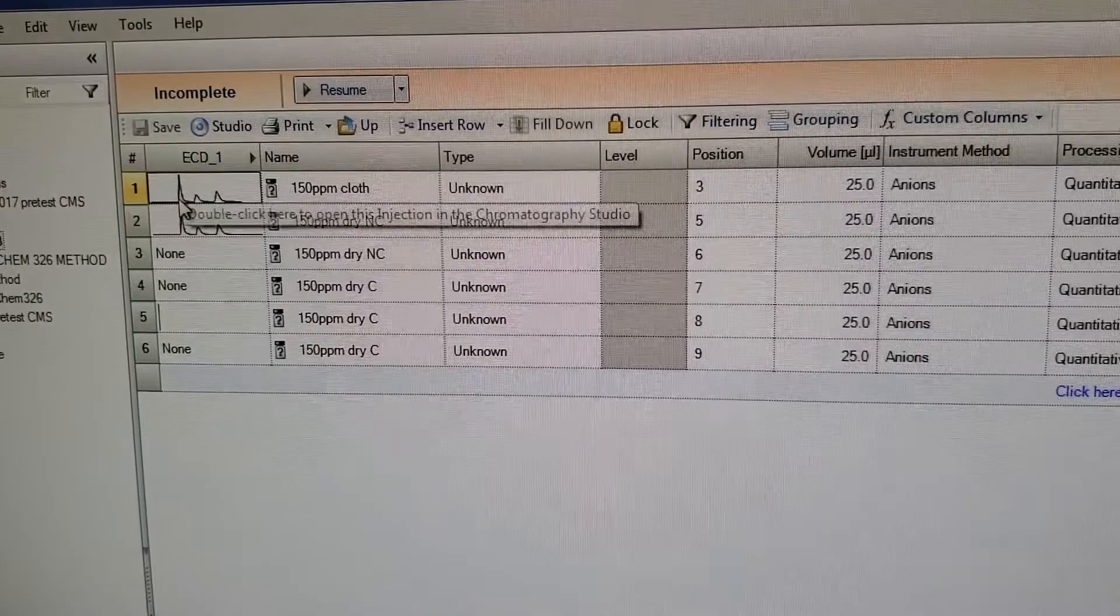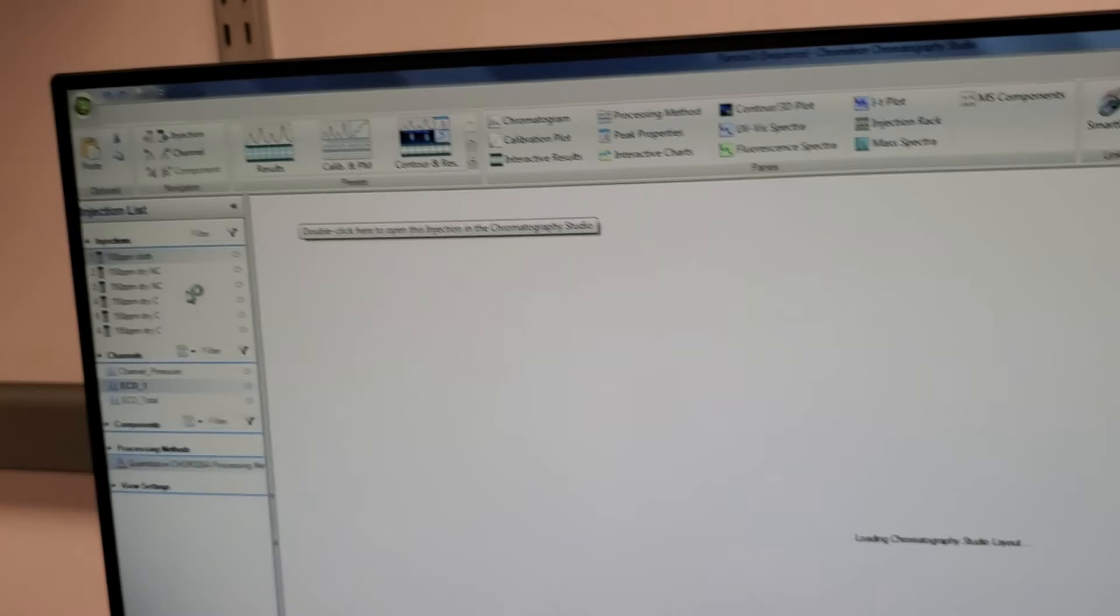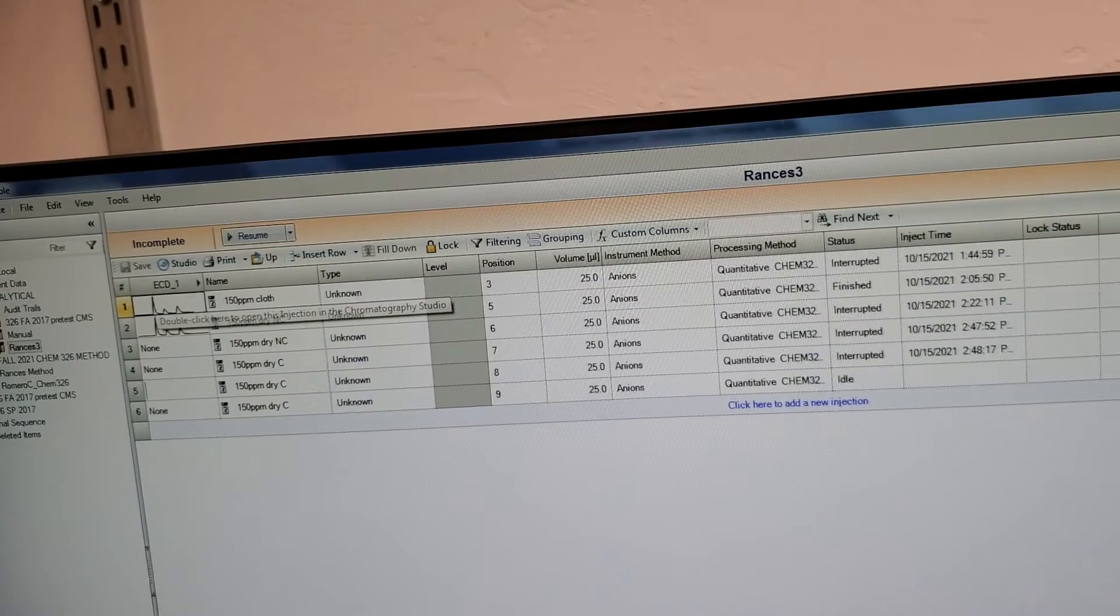So each one of these lines is its own chromatogram, right? Each trial. You can also see all of your injections right here, so you don't have to go back between programs. You'll just find it there.